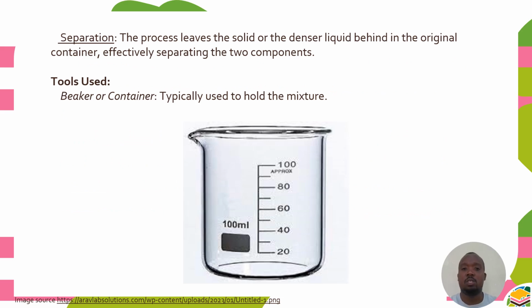Now, on separation, the process leaves the solid or the denser liquid behind in the original container, effectively separating the two components.